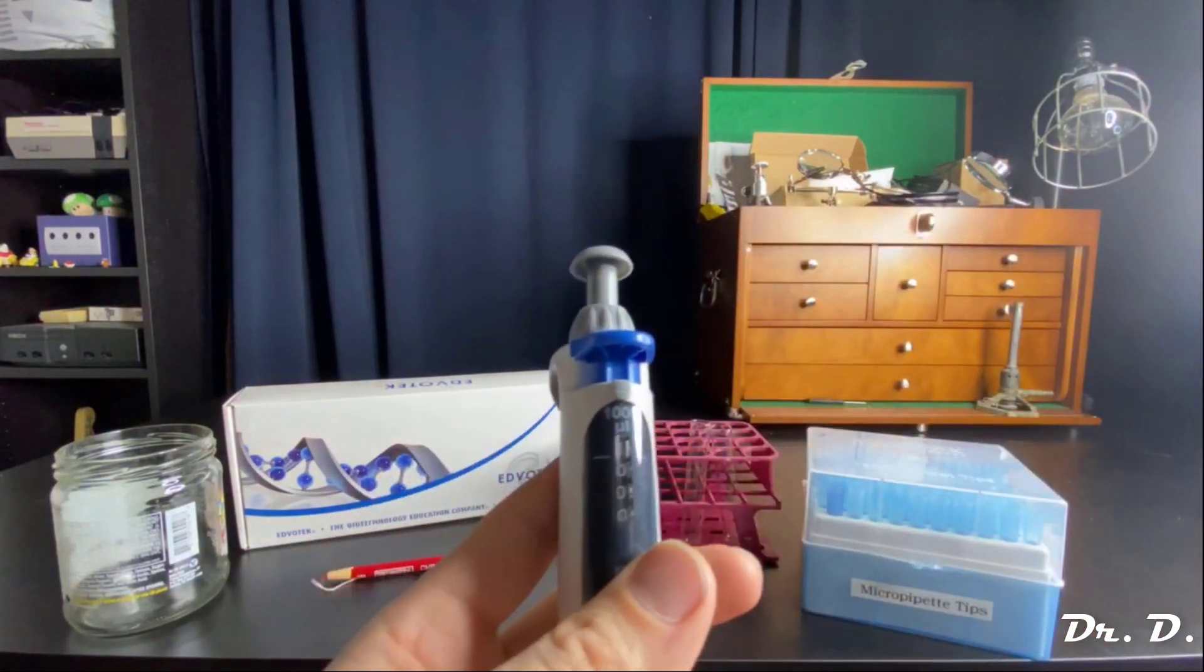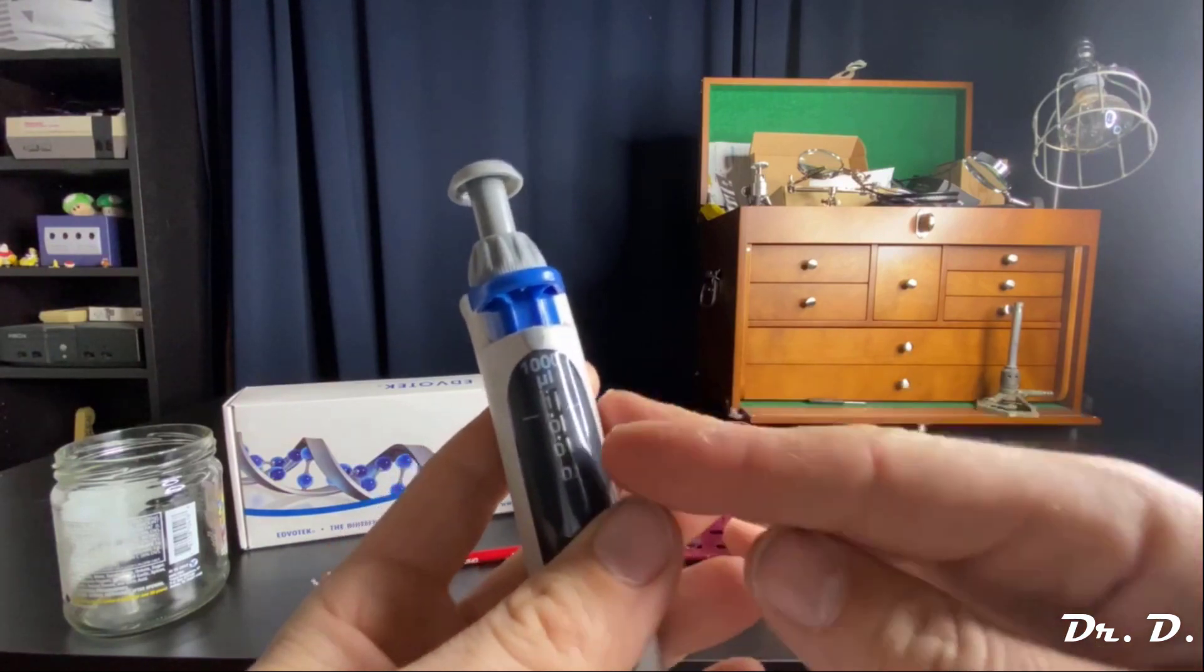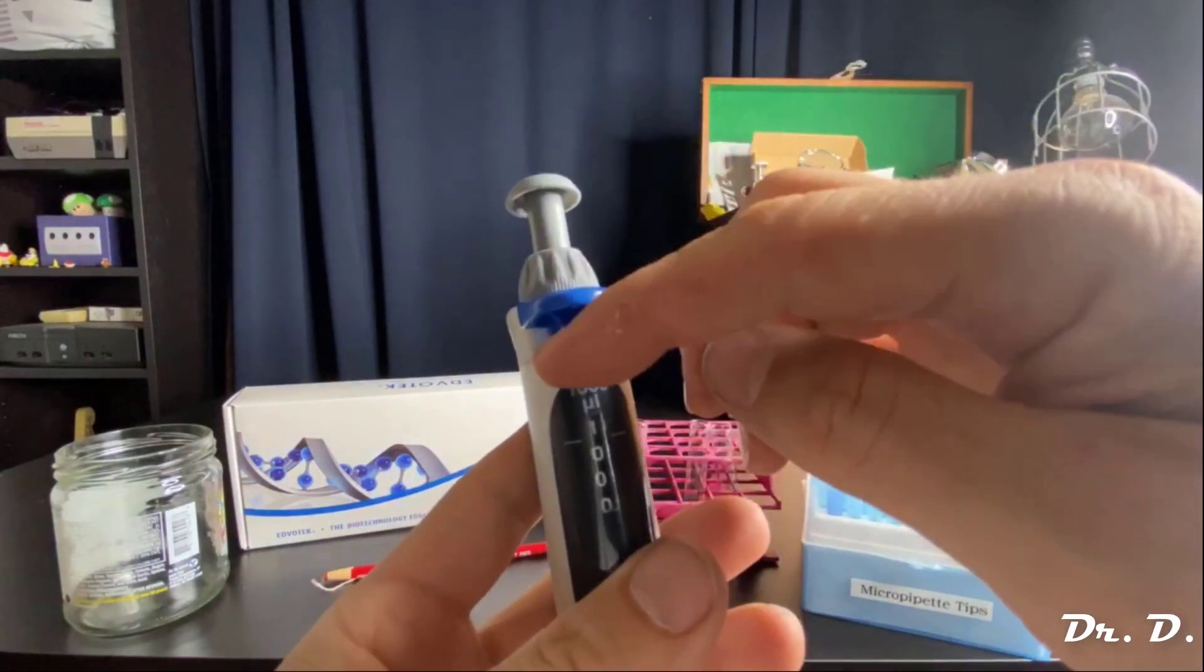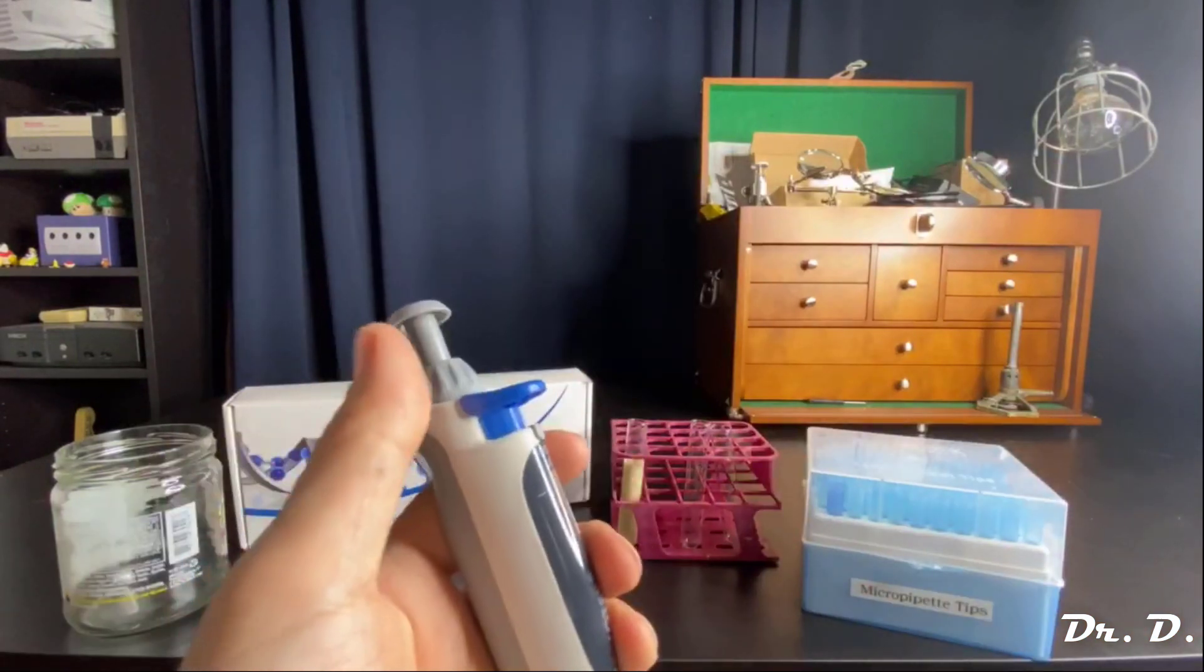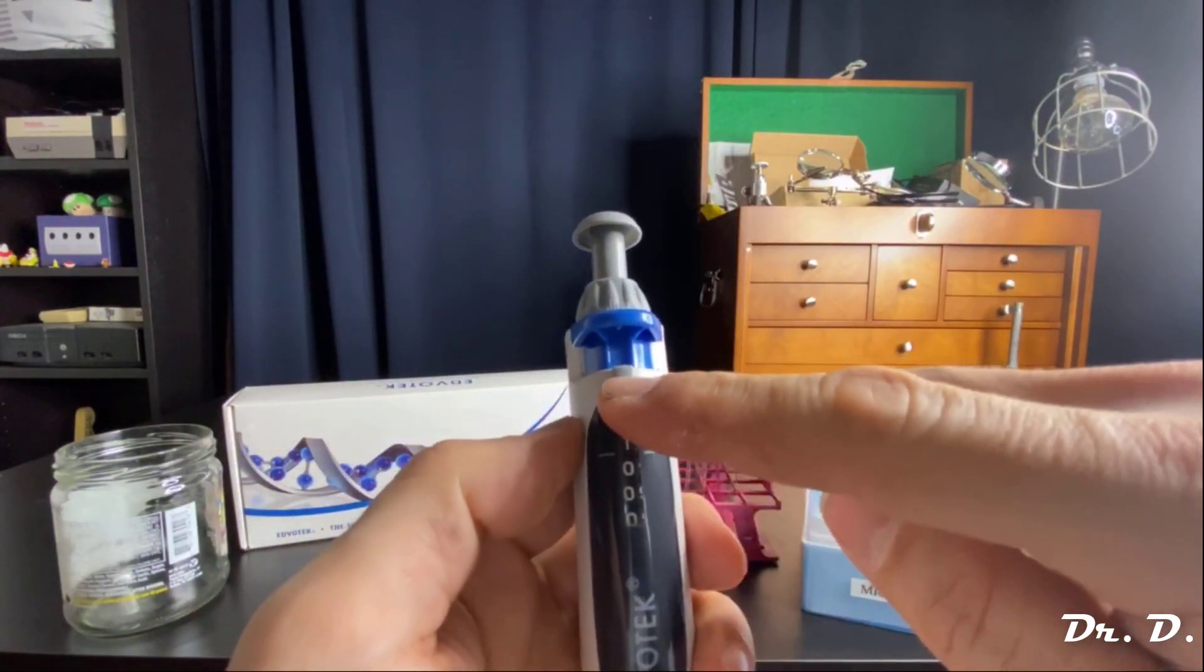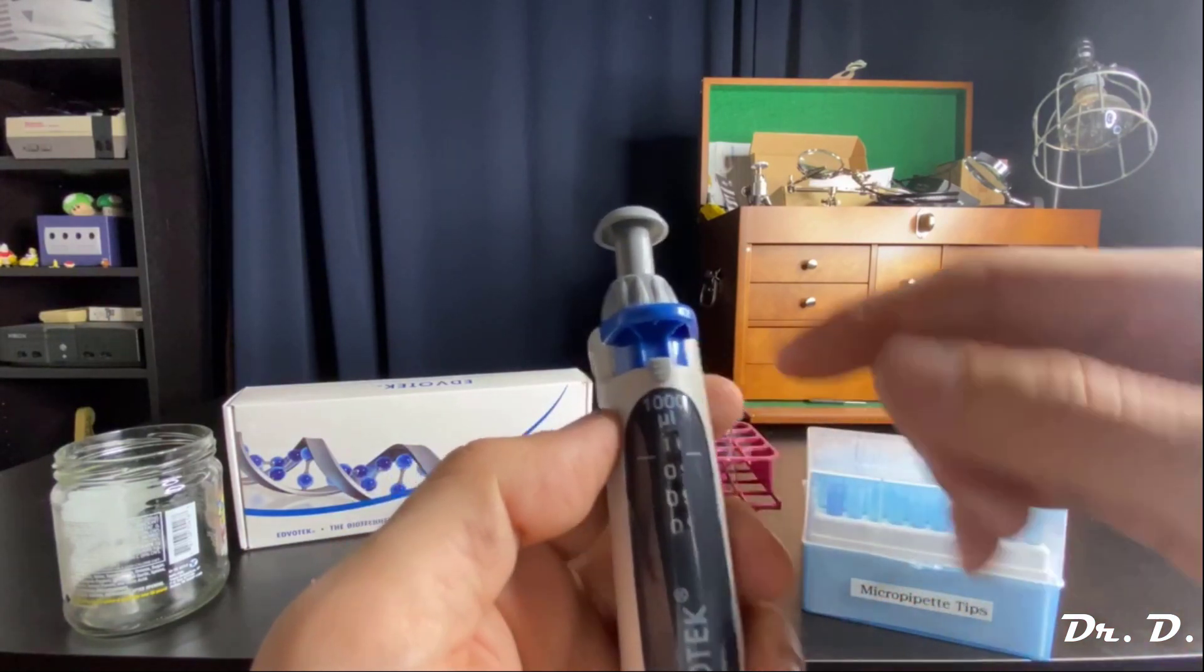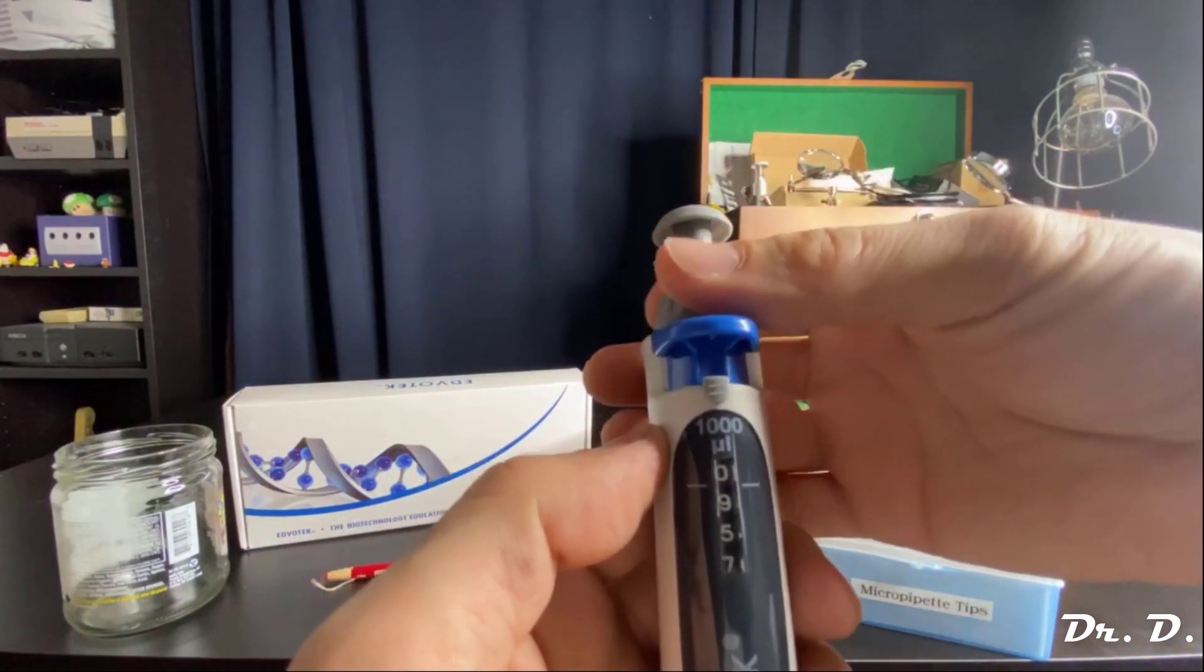So the manufacturers recommend that when you have set your micropipettor that you lock it in place and then use it. And then when you're ready to change the volume, you push this little notch up. You push that button up and that allows you to freely choose a new setting.